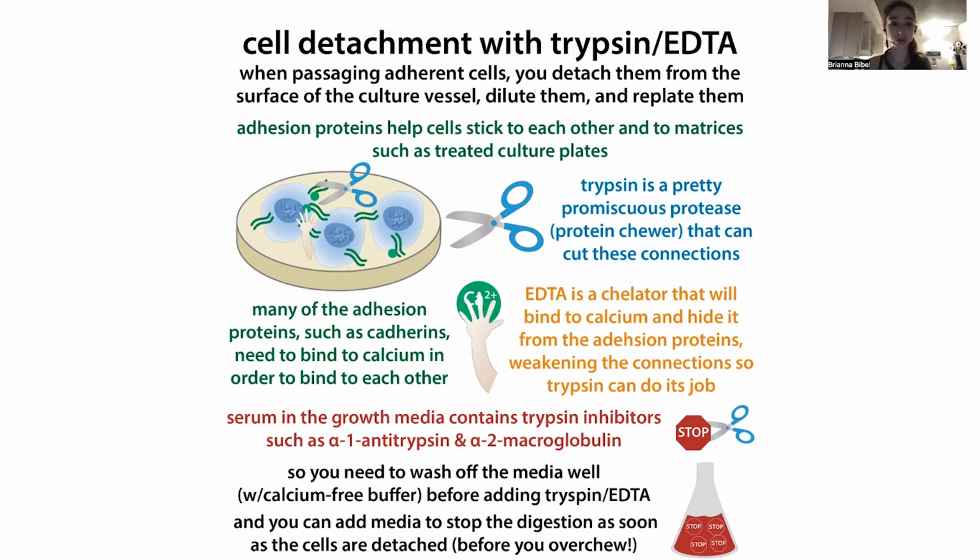And so you need to be able to measure the concentration of your cells. But you want to only measure the concentration of those live cells because those dead cells aren't going to contribute to anything. You want to know if there's too many dead cells, there might be some sort of issue and your cells might not even survive if you try to plate them. It might be better to go back to a new stock or something like that. But you want to know how many of the live ones there are, the viable cells there are. Typically, we measure this per milliliter, and then we can calculate how much to plate on a new dish. And so I'll get more into that in a second.